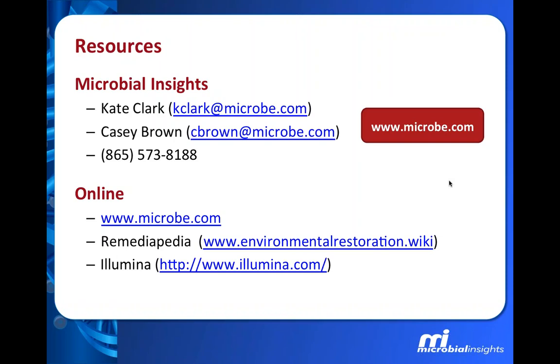There is a question that says, can the low abundance be an artifact of the amplification process? Yes. So two things. With any amplification, you can have where the primer set, the DNA sequences that have been designed that are trying to be unique to all microorganisms, just aren't selecting for particular groups of microorganisms. You try to cast a really wide net, maybe you can't always do that.